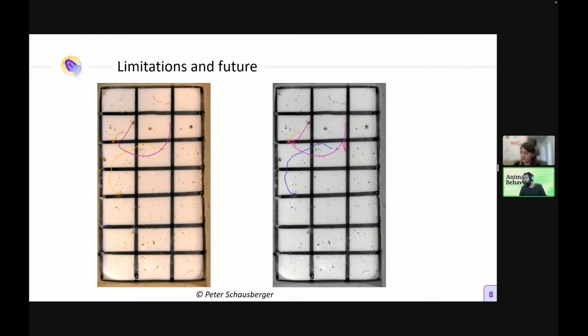And we have another comment from Raphael Durshade again. Do you have plans to have the identity correction in place? Maybe plans to have a model of how the animal moves? What are your plans and funding to support AnimalTA going forward? So it's two independent questions.